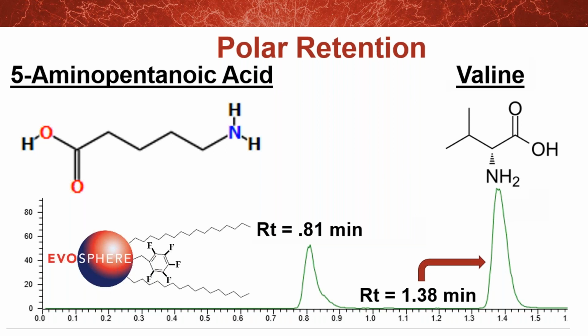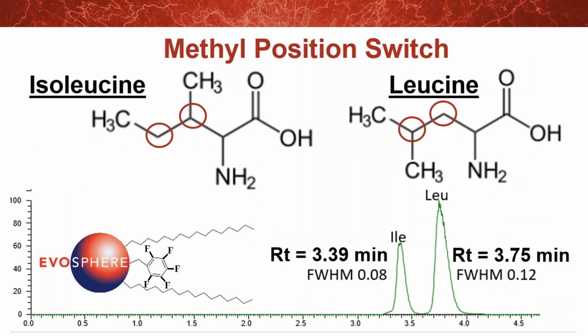A lot of times when you see negative log Ps, a lot of people would approach this with either a HILIC method or some other approach, or derivatization, or ion pairing, or high pH work. And this is being done at low pH with formic acid, mainly driven because of the monodispersity, the high surface area, and the novel bonded phase chemistry.